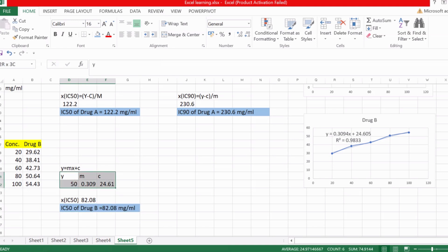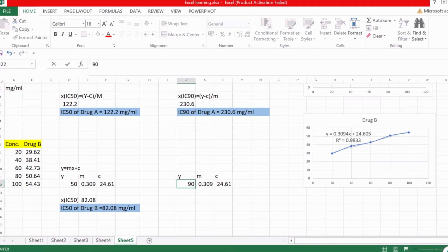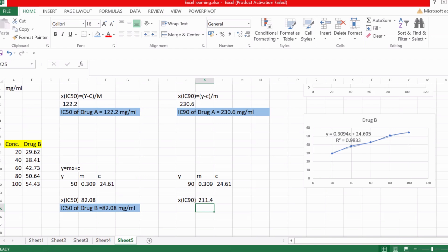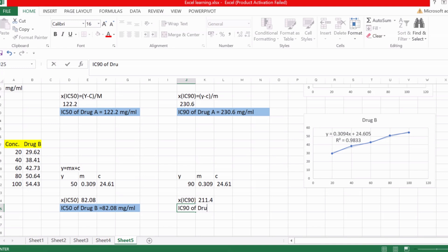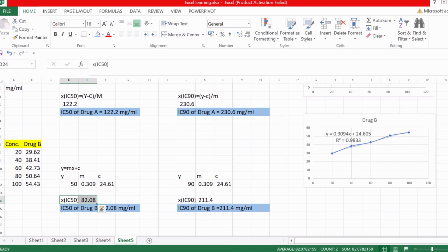For the IC90 of Drug B, the same equation is used with y changed to 90 while m and c remain the same. Entering the formula x = (y − c) / m in Excel gives us the IC90 of Drug B as 211.4 mg/mL. This is how we find IC50 and IC90 values from percentage cell inhibition.